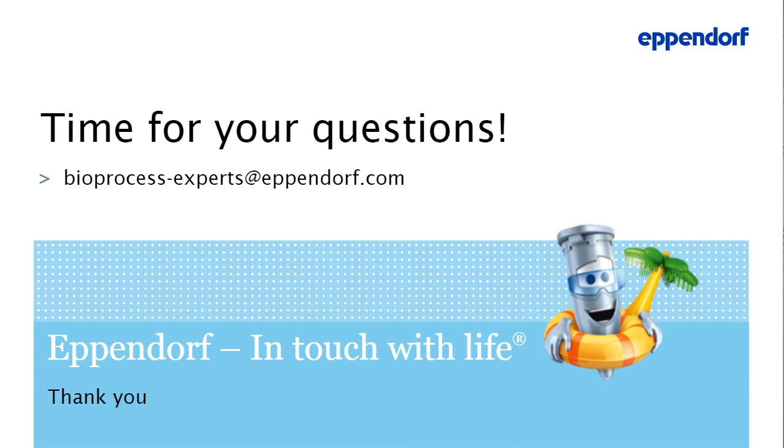The first question for today is, does the material and shape of the vessel have any influence on the growth of cells? Definitely. Selecting a material that is chemically inert is important. For example, stainless steel, borosilicate glass, polystyrene or silicone. Especially for single-use vessels, certified quality will mitigate issues with leachables. There's also a question of whether to use rounded or flat bottom vessels, which one is better. Round bottom vessels will give you improved flow behavior. But flat bottom vessels have minimal influence on the flow behavior, but they stand better. So again, reactor and impeller geometry will team up in flow dynamics, so it's important to consider all these factors.